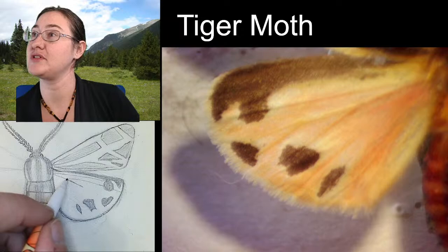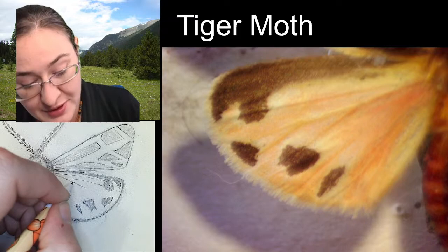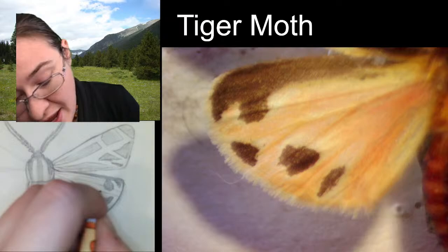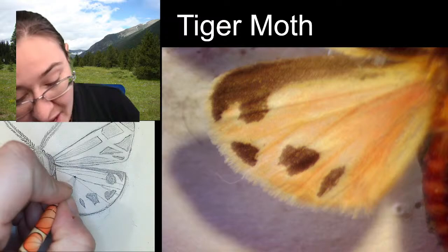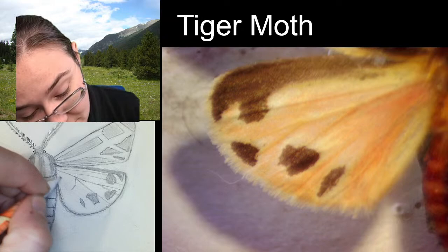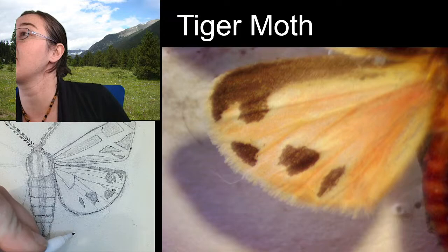Comes down. Okay. And then we have one that comes off of the bottom here and goes through the third spot. In this region, this guy ends up coming up and dividing into halves and splitting into two. And then the cross vein that's going to create this cell comes out from around where this one comes down. It's going to be coming out, down, and then coming back around this vein here. So that's that cell. And then you have two veins that come off from the center of the cell and one vein that comes off from the bottom of the cell.